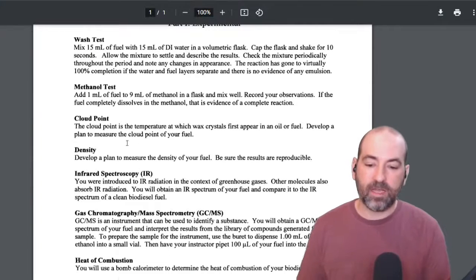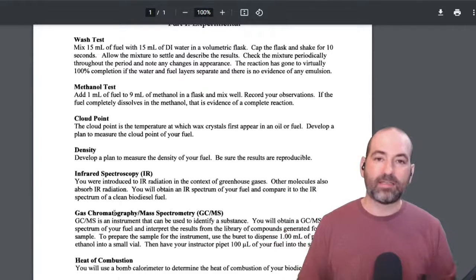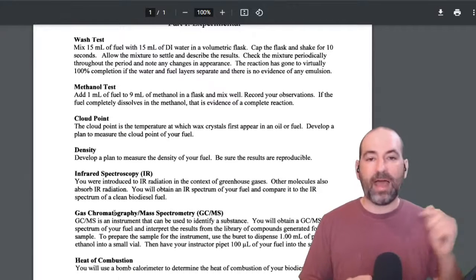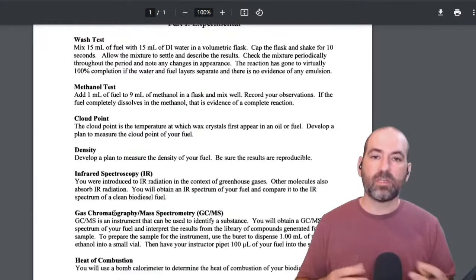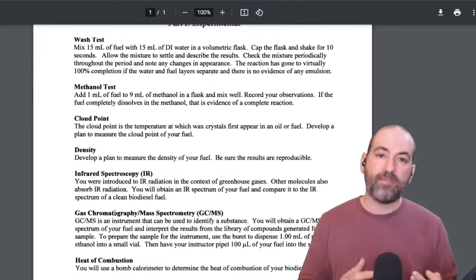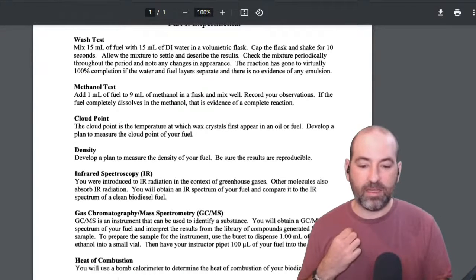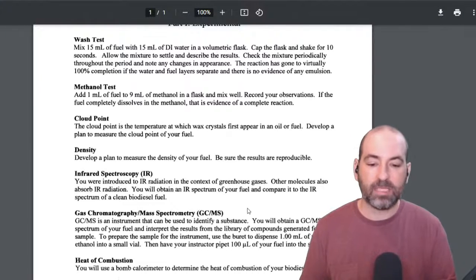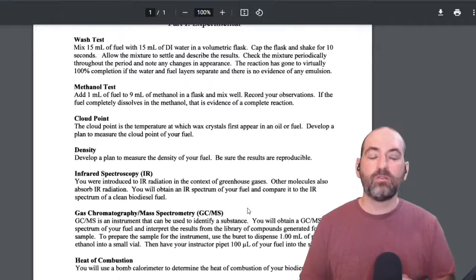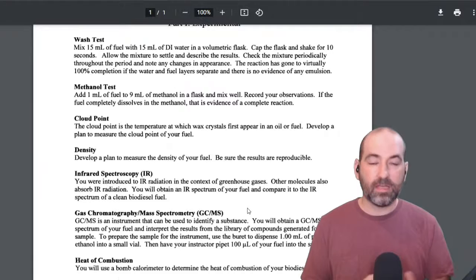So what this is, kind of like the chromatography we did before, but this time it's a big fancy machine, and it first heats up the sample to turn it into a gas, and then passes it through a really long tube filled with special materials that some chemicals bind to better than others. And that separates the different components of your mixture. And when it comes out the other side, each particle is essentially weighed by something called a mass spectrometer, where it can use the mass to figure out what that molecule is and look it up in a database.